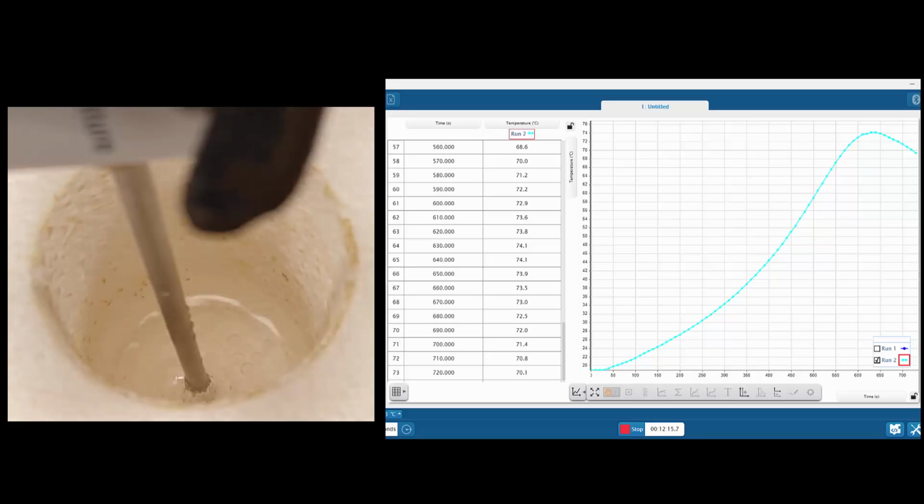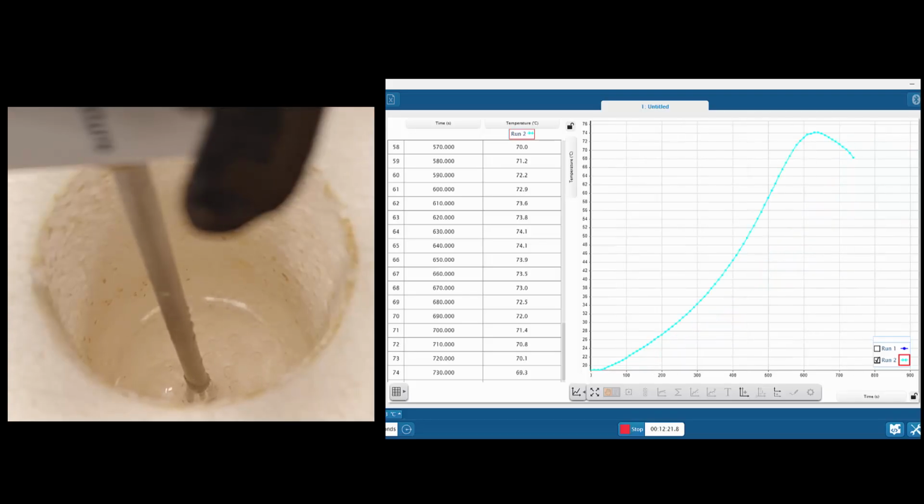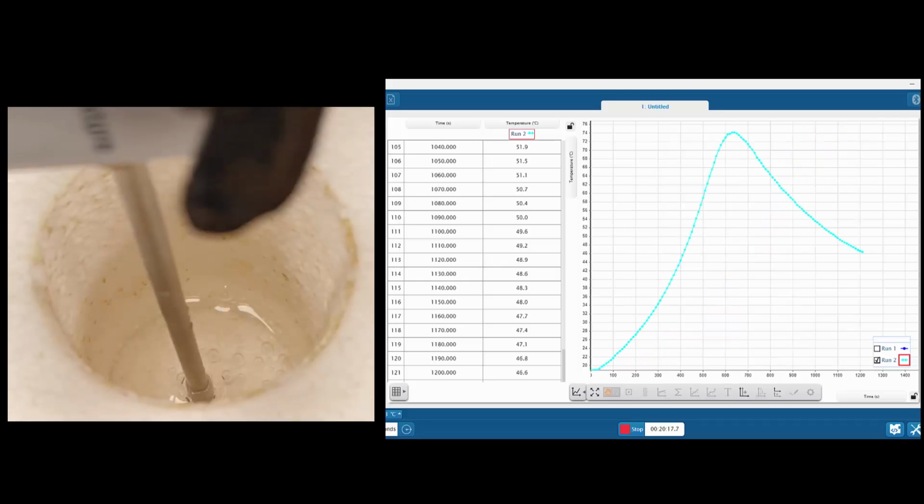So as you get up to the 60 or 70, it cools off so rapidly that even when it's dropping, it's still actually reacting. And even when it starts to slow, you can still see fine bubbles coming off. So I just give up after 20 minutes and it never really finishes, and the rate of cooling is really quite slow. So there's a huge error.